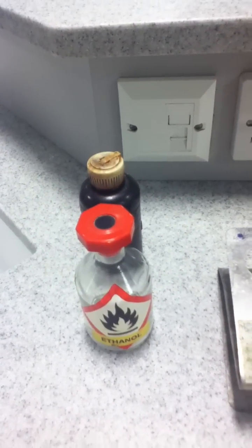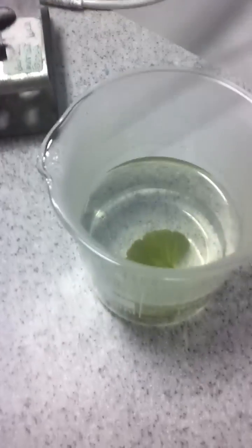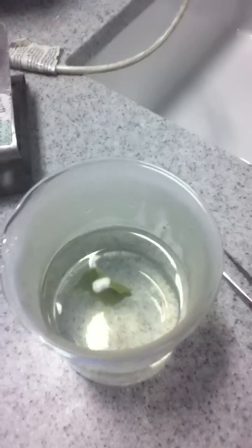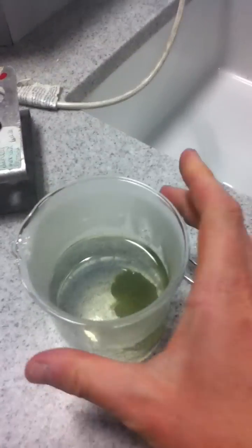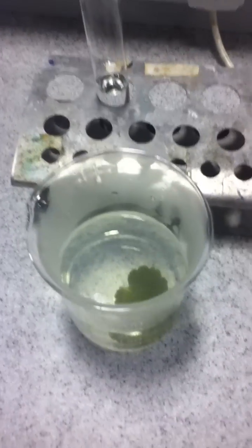Whilst the leaf is in there — you can see already it's starting to go a bit soggy — boil the kettle again because you're going to need freshly boiled water again in a moment. Next step: once the leaf is nice and soggy — I'm rushing here as this is a demonstration, so I'd leave it a little bit longer than this.